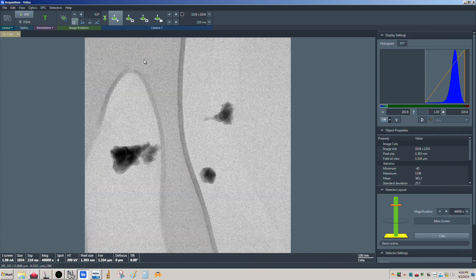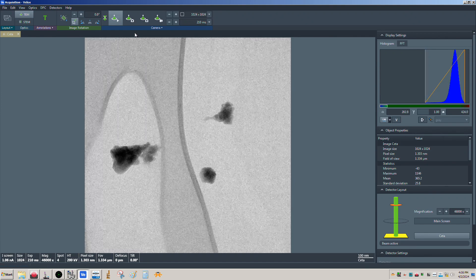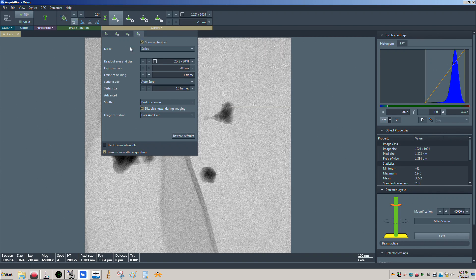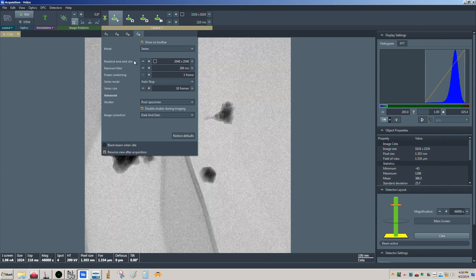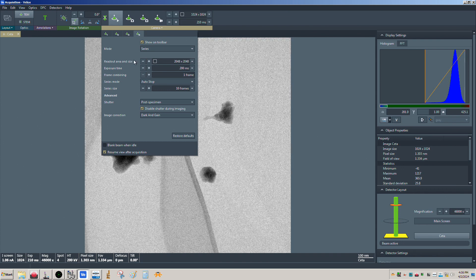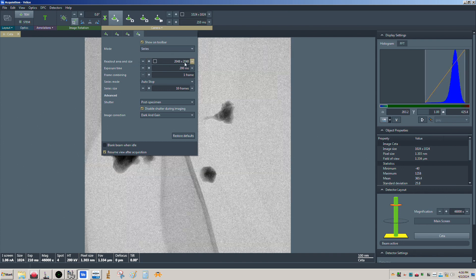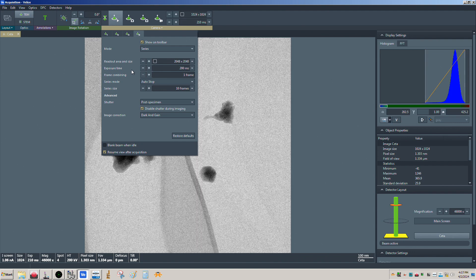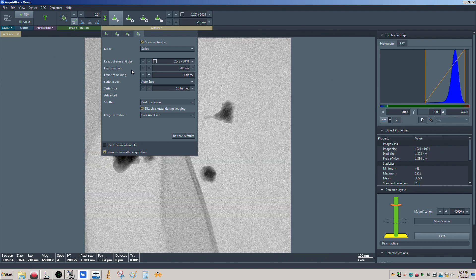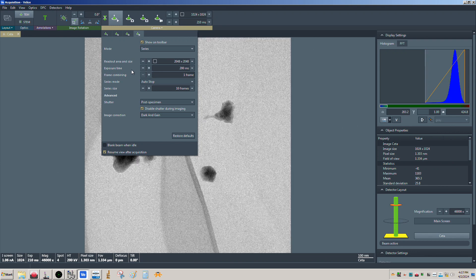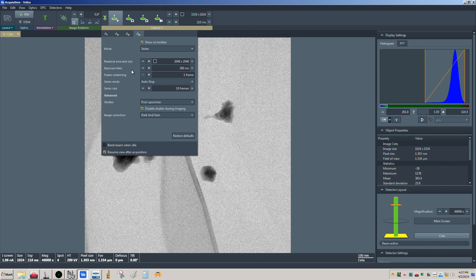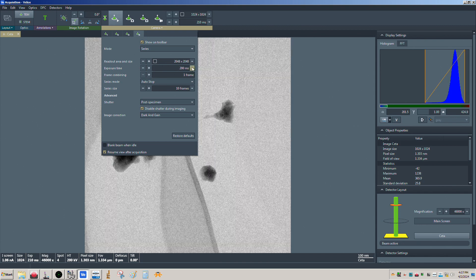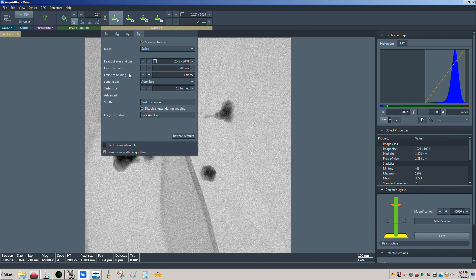That instability becomes easier to see the higher your magnification is. We can still deal with it by doing drift corrected frame integration. Come to the camera panel here and click on the last button, which is the series mode. Specify your readout area and size — I'm using full frame at 2K — and then set the exposure time. Just like in STEM mode, we're going to reduce the time per frame.